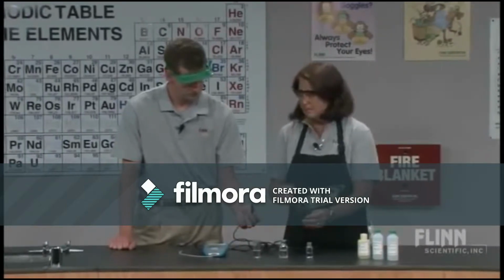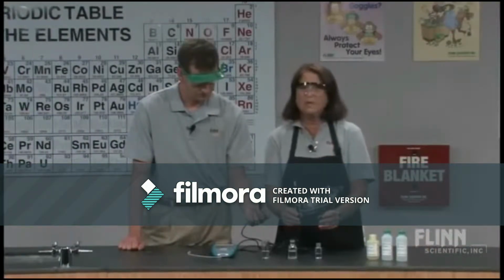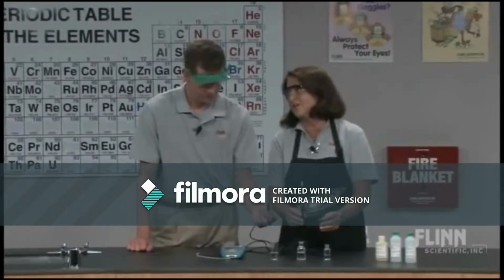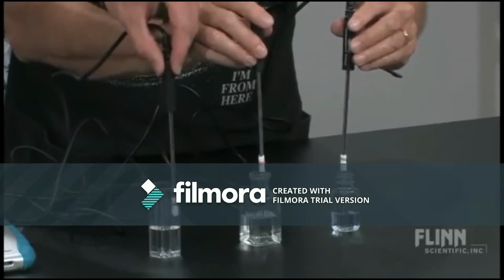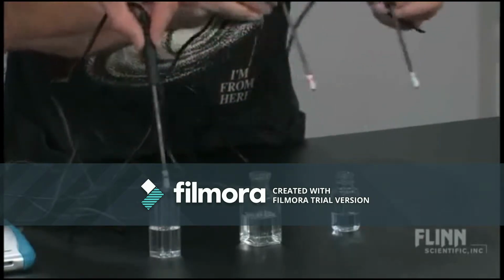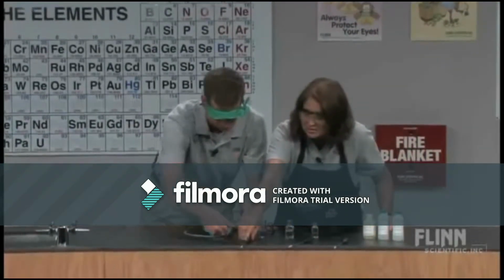As soon as that's done, we're going to go to the LabQuest. And Mike has already set up the LabQuest to take data from all 3 probes. It's going to be recording changes in temperature. We'll be able to see this. And we're going to take data for 120 seconds. That's not too very long for an experiment in a chemical lab. So let's point down. And Mike, on the count of 3. 1, 2, 3. Down. They're soaked. Remove. Lay the probes down. All we're going to do is make sure that the probes are off the tabletop, and Mike's going to start the experiment.